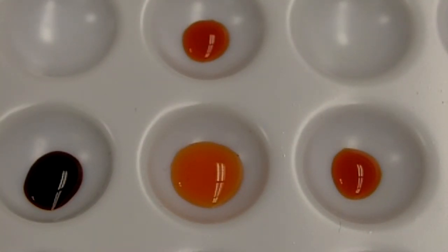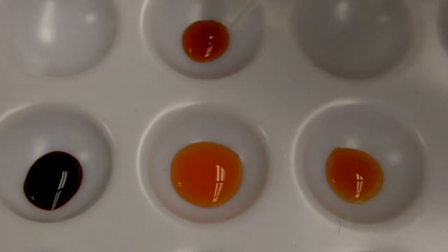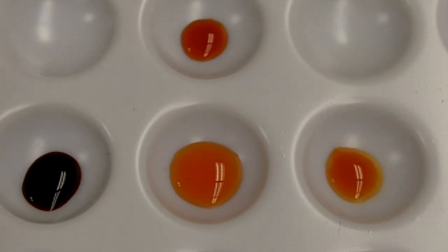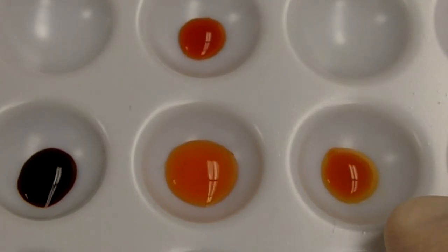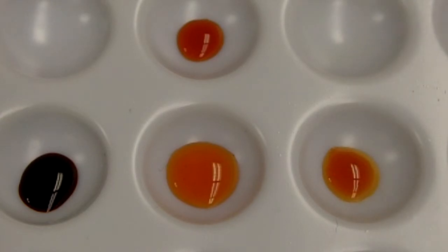Finally, we have well number 3, where we're going to add Na2CO3, 1 drop there. It looks like, in comparison to the color control, we have a definite lightening of that particular color. It also looks like there's a precipitate in there. The identity of that precipitate given in your data table, Fe(OH)3. So effectively, when Fe(OH)3 forms, you have the removal of the Fe3+ from equilibrium A, and the equilibrium will shift as a result of that removal.